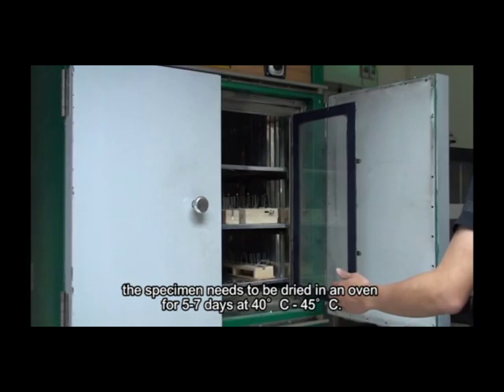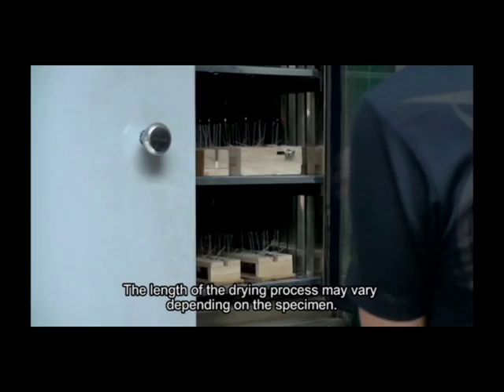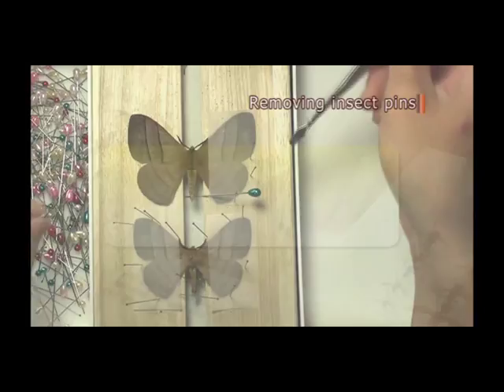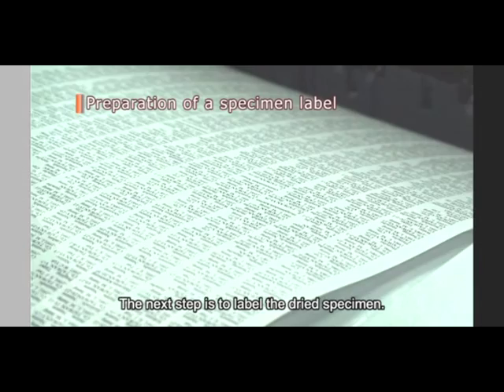Once in place, the specimen needs to be dried in an oven for five to seven days at 40 to 45 degrees Celsius. The length of the drying process may vary depending on the specimen. When dried, remove all of the pins except the main one through the thorax.